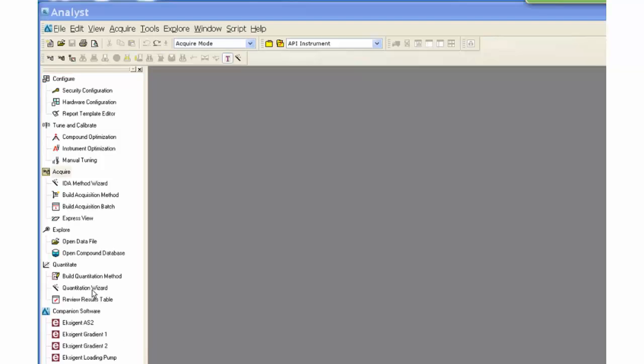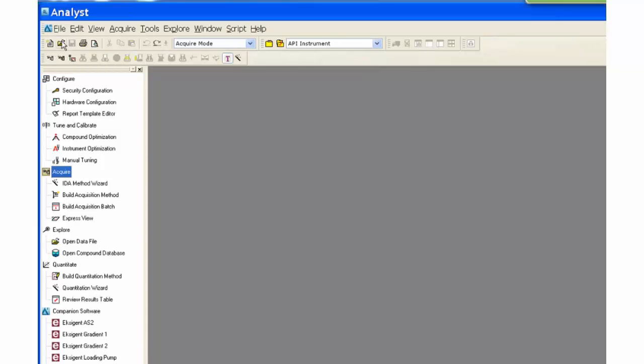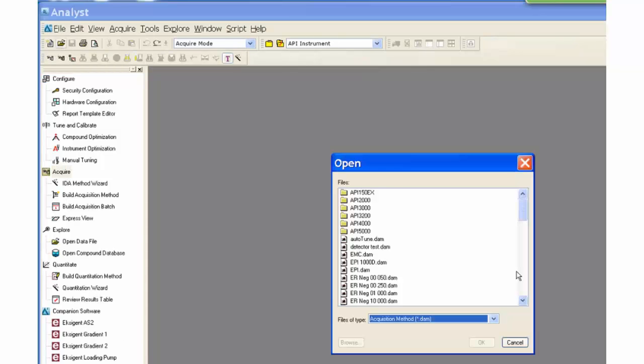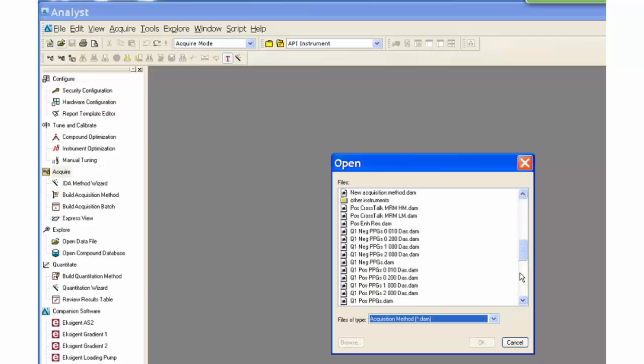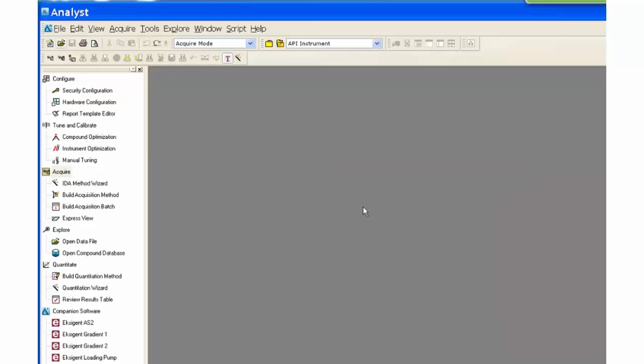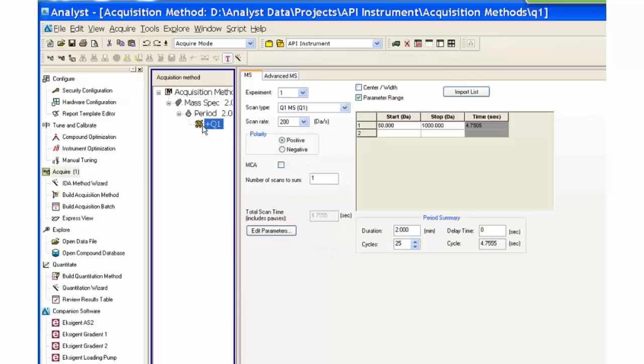We will open a previously created method in acquisition mode. Notice that there is no start or acquire button. This is a different view for the manual tuning view.